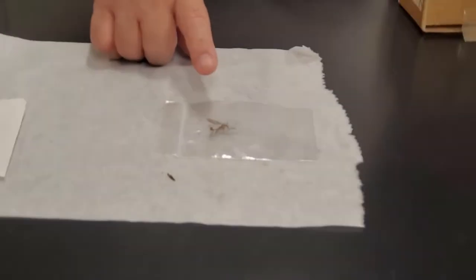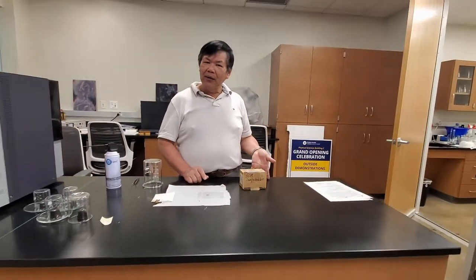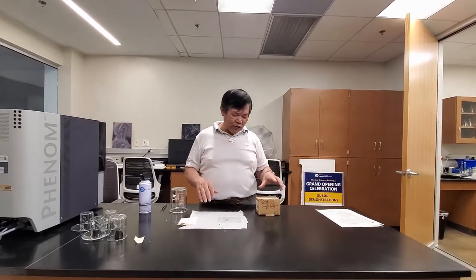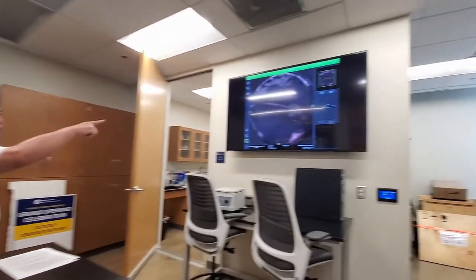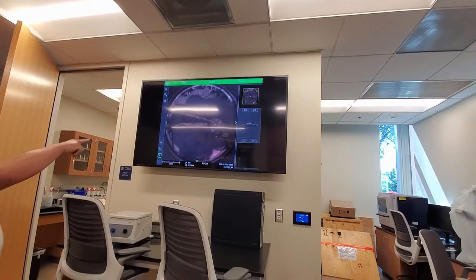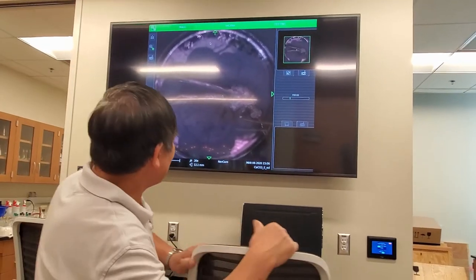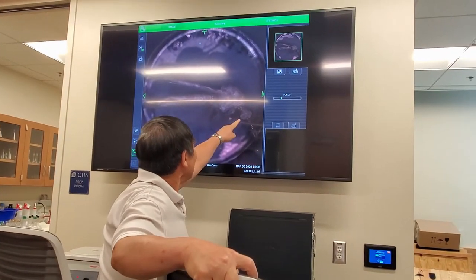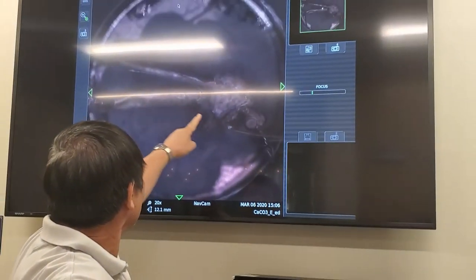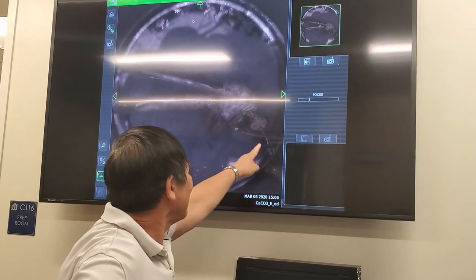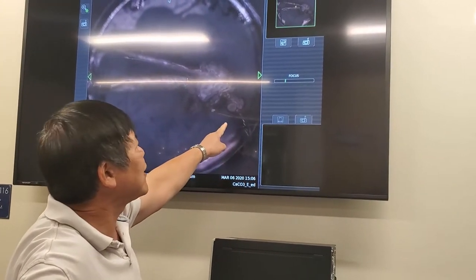Now what I've done is I mounted it onto the SEM. I'll remind you guys how to put the sample in later. I've already loaded it on the microscope to try to bypass five minutes of warm-up time. So what it looks like on screen — the crane fly is gold coated as we normally do. There's the eye, there's a body, there's a wing piece right there. There's what they call the thorax and then there's a mouthpiece. This is a little bit different from the mosquito.